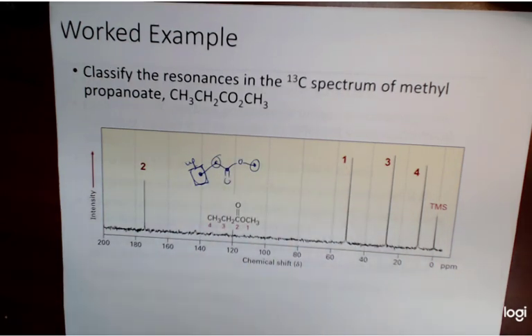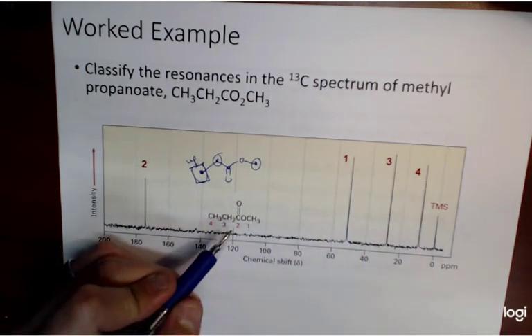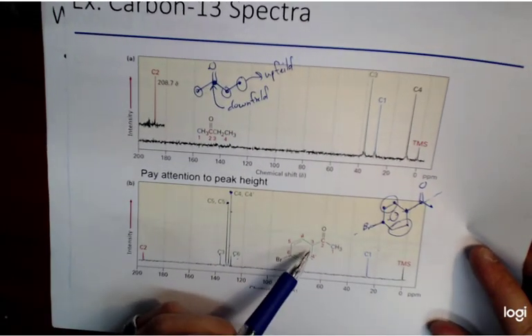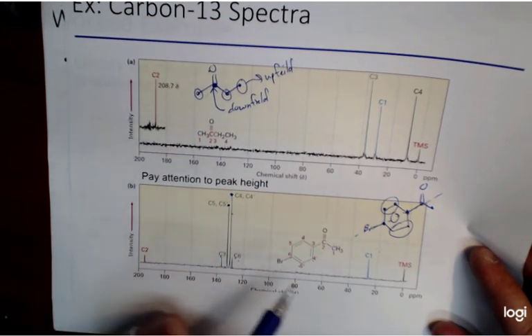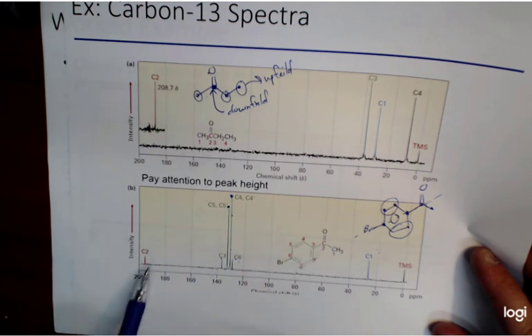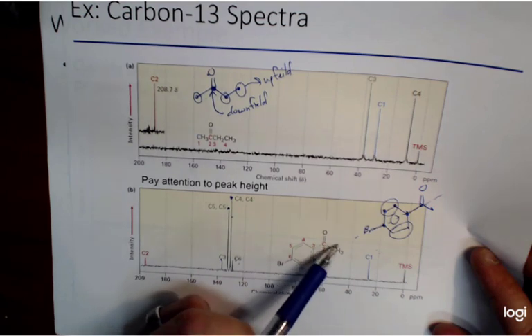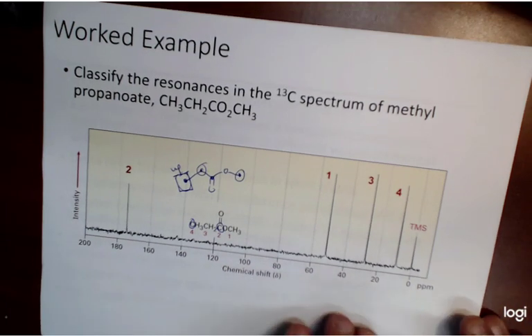I'm not going to worry as much about you necessarily getting these 2 correct, but 2 and 4, you should know the extremes. And also going back to looking at this structure, you should kind of know where these are. And you should also know where the carbonyl carbon is, all the way down here around 200. And then of course the aliphatic ones are going to be close to 20 somewhere. But that's really, generically, what you're looking for.